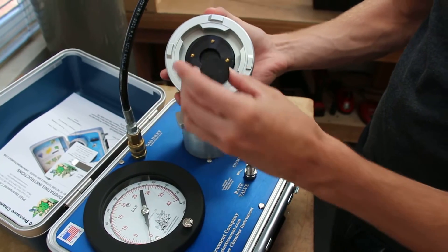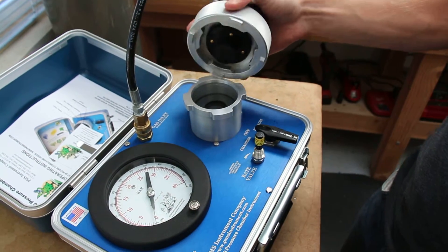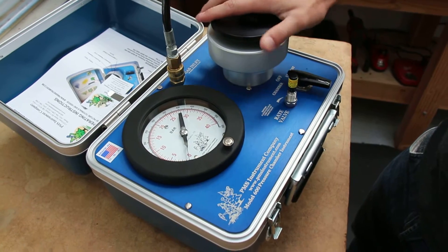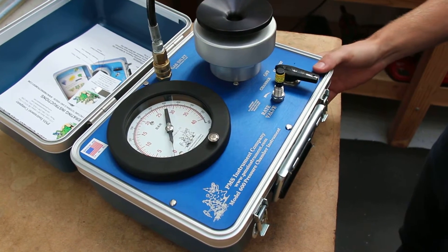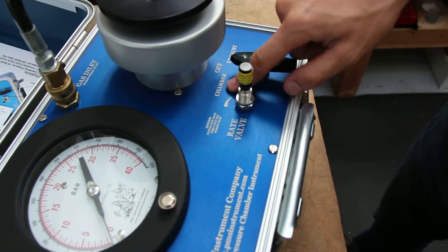You can also seal the chamber by inserting a sample into the compression lane gasket. Now take and put the control valve to the chamber position, which begins to increase the flow of pressure into the chamber.